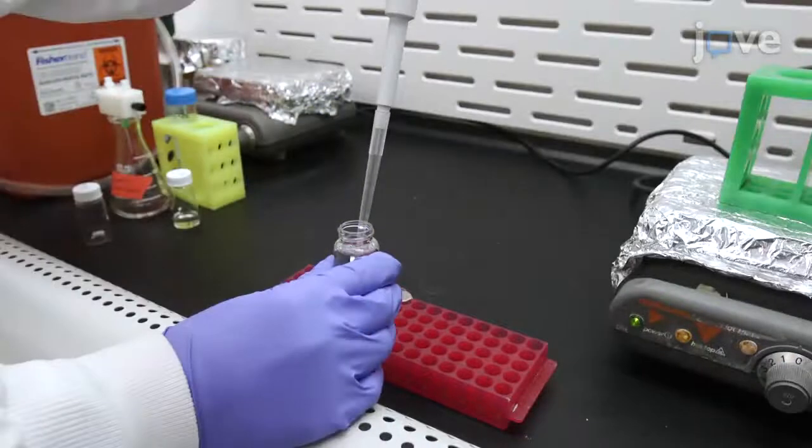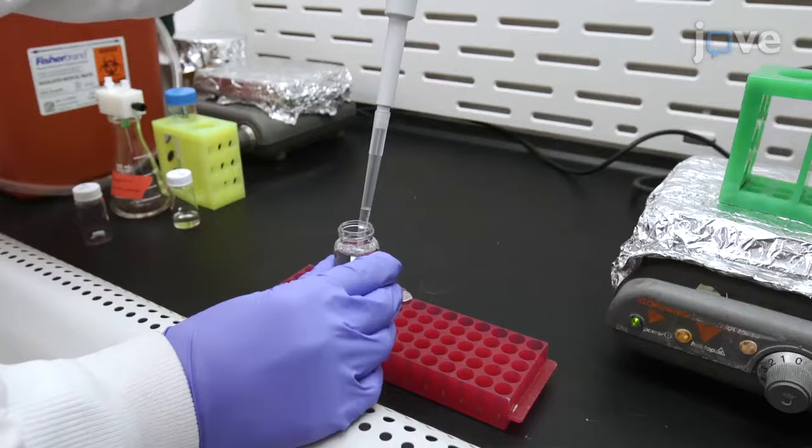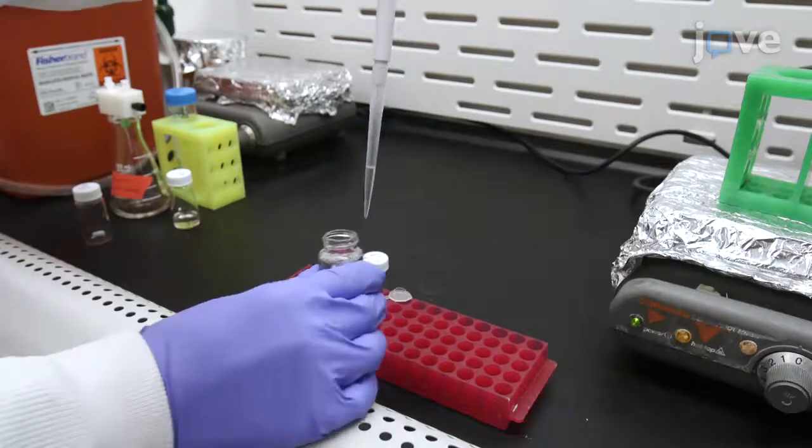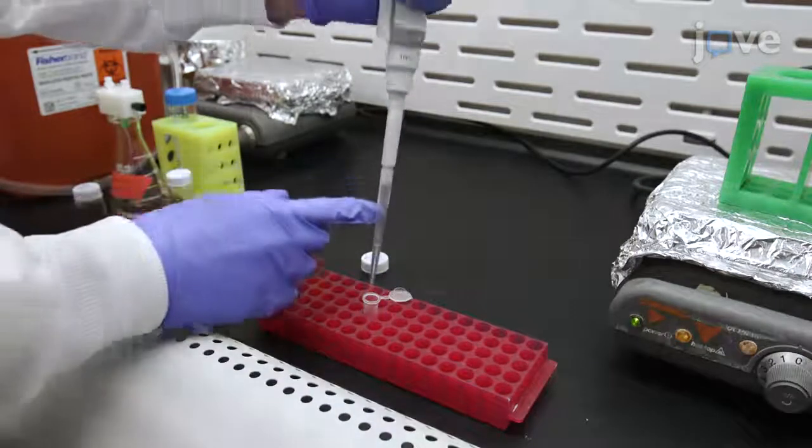Then, pipette 0.25 milliliters of a 10-milligrams-per-milliliter solution of a block copolymer stabilizer in THF into the same tube. Vortex them.